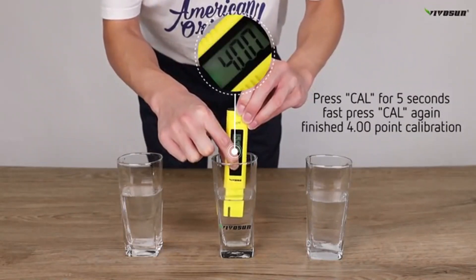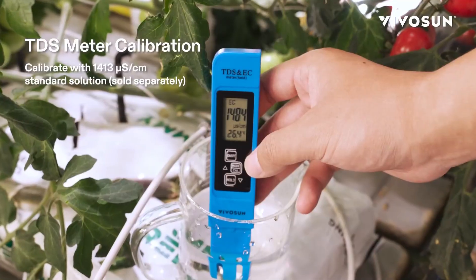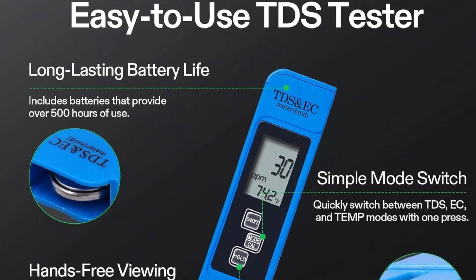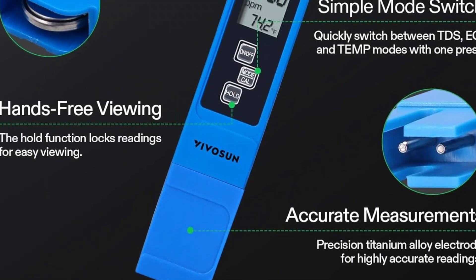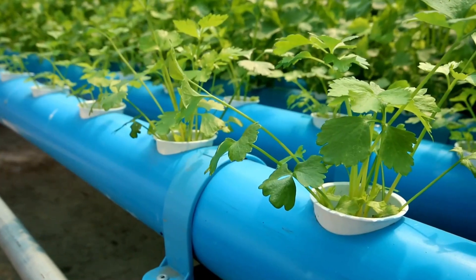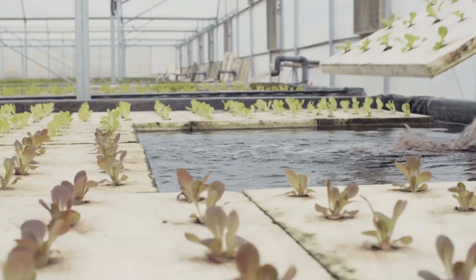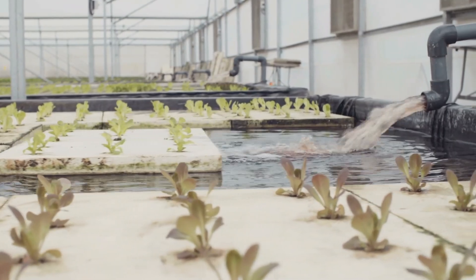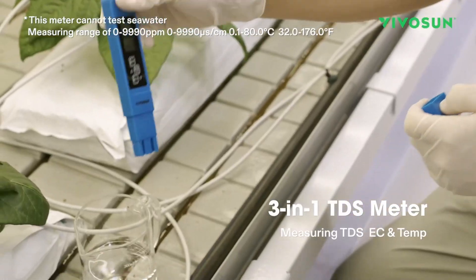But the kit doesn't stop there. It also includes a 3-in-1 meter for TDS, EC, and temperature. TDS means total dissolved solids — it measures the amount of organic and inorganic substances dissolved in water. In hydroponics, this indicates the concentration of nutrients. Too many can burn your plant's roots and too few will leave them malnourished. An accurate TDS reading allows you to optimize the feeding of your crops.